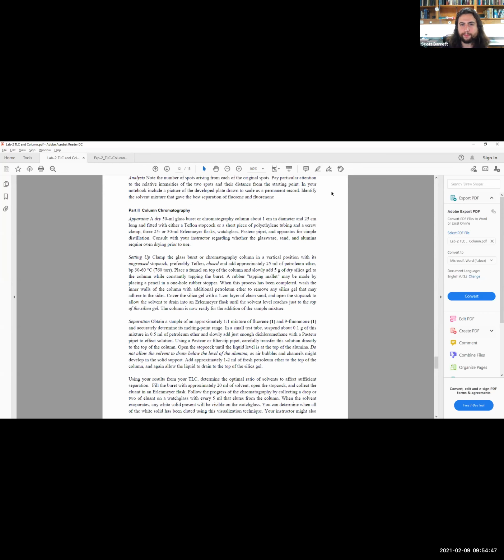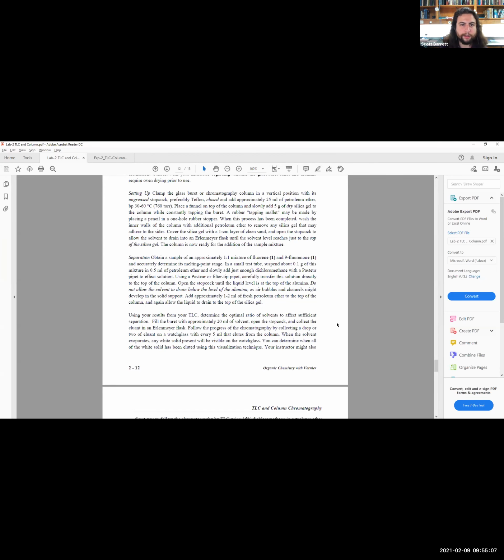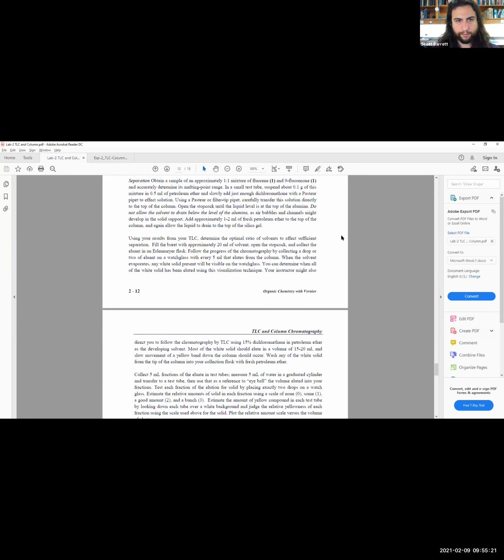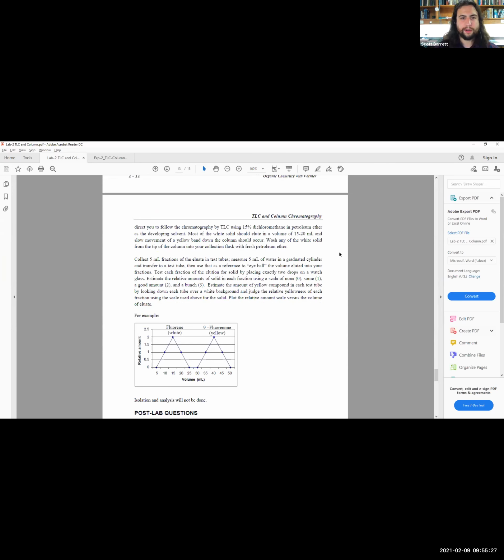Then this would be the setting up of the system, utilizing our stationary phase and setting up our column for chromatography. Then putting our petroleum ether in there and adding dry silica gel, packing up our column and getting it ready. Then we get our sample with a mixture, suspend it into some petroleum ether, and then add DCM, dichloromethane, with a pipette. Going forward, we'll skip through because this is more of the systems that I was speaking about above.